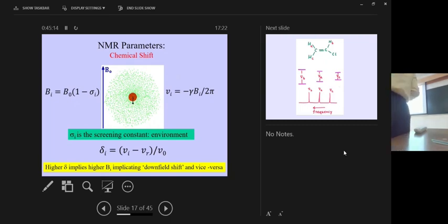So here also it is the same. You have a magnetic field applied. A magnetic field induces currents in these electrons and generates an electric current. And when the electric current is generated, it produces a field. This comes from electromagnetic theory.